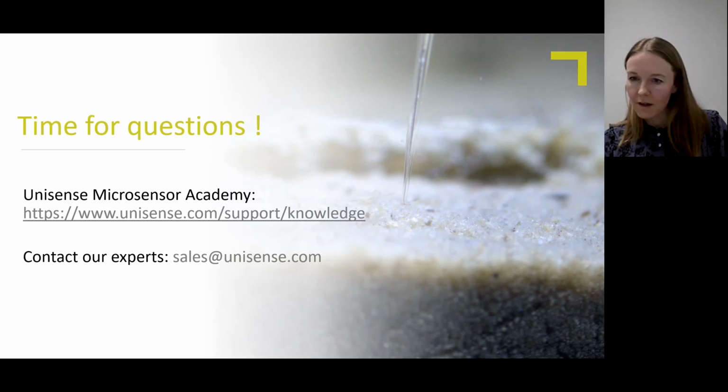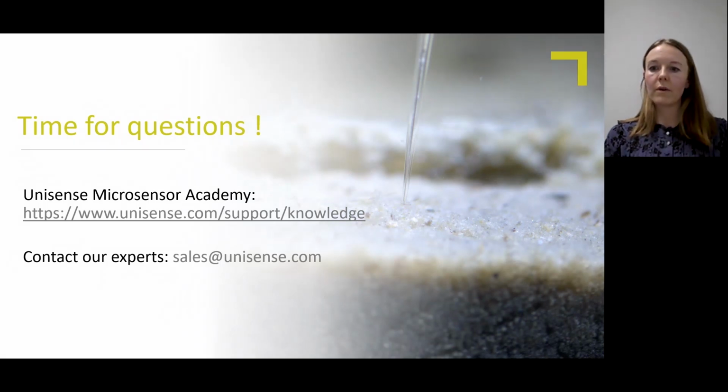Protons, I'm not sure what you are referring to. The hydrogen sensor measures the partial pressure of hydrogen gas, not the protons. Please elaborate your question if I am not getting it right.